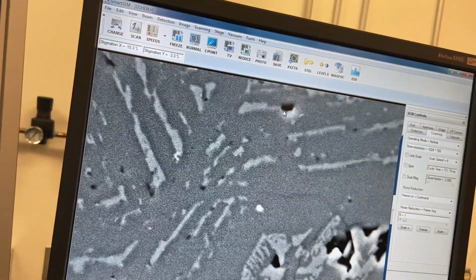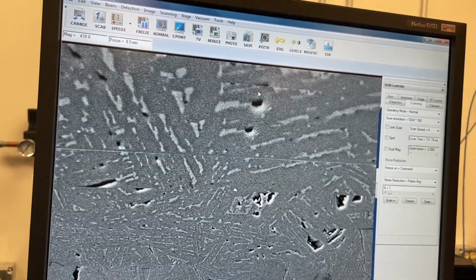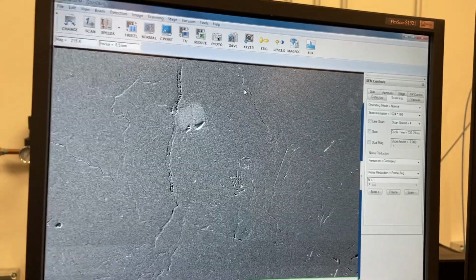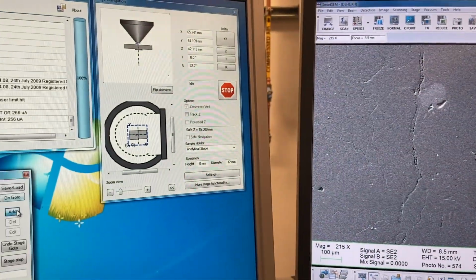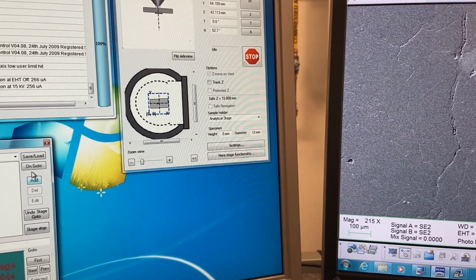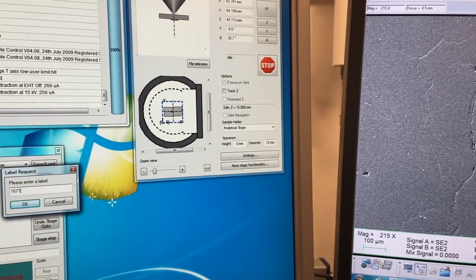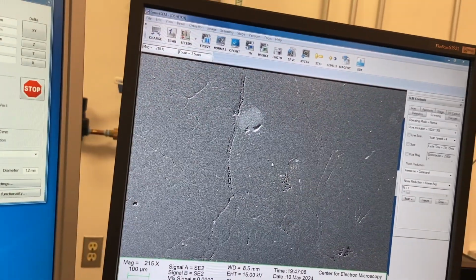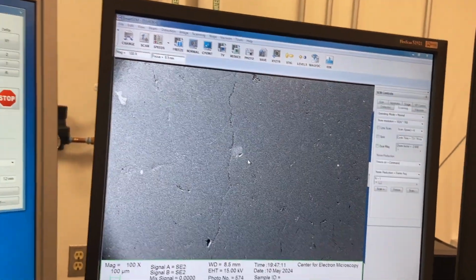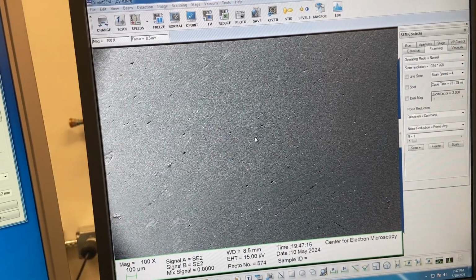That's okay. All right, and now that I'm good, I am pretty much all set here. So let's go back. And I'm going to save this as my sample number, like that. Actually, that was completely opposite here. 67. There we go. All right, cool. So that's good. So that was the first sample, and now let me navigate to sample number 2. So I'm just moving across the first one here.